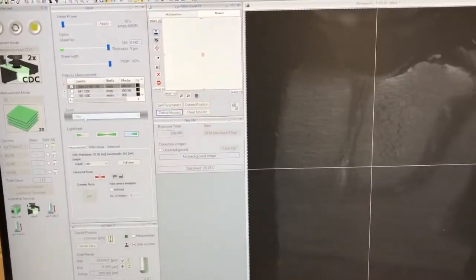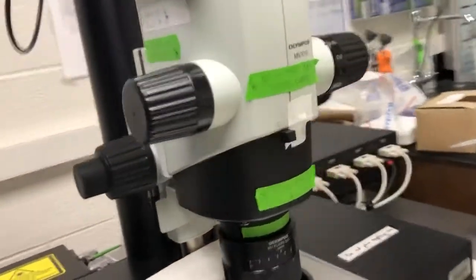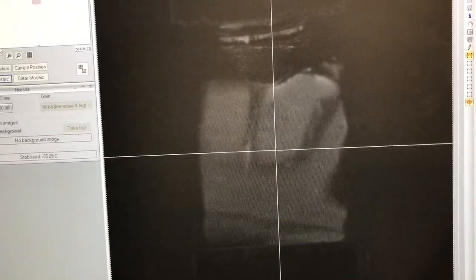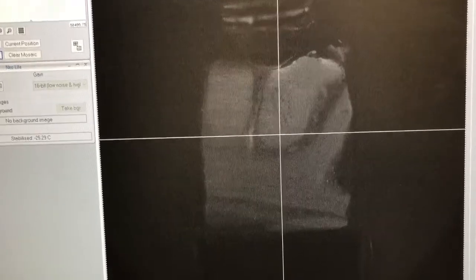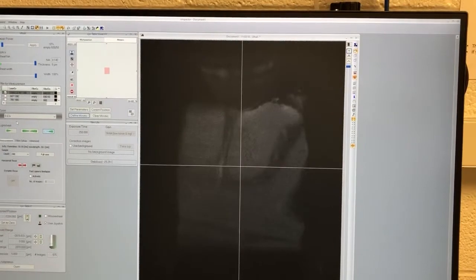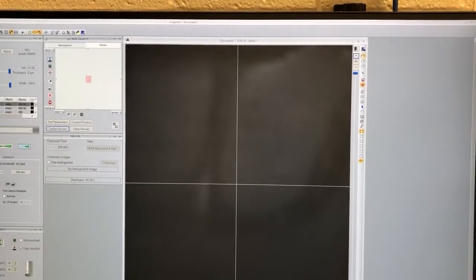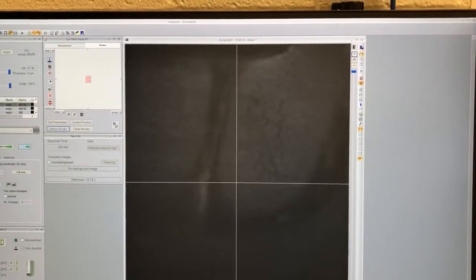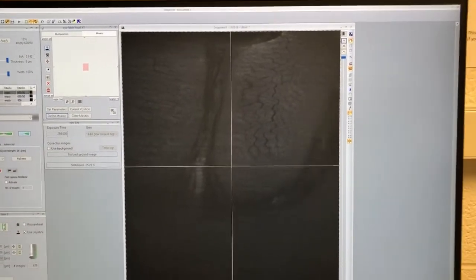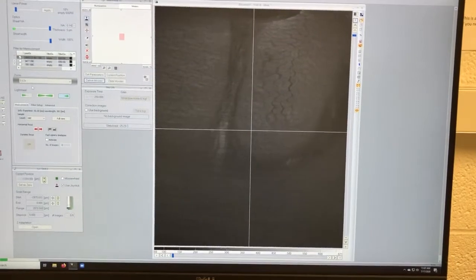There's a deeper issue: what should the zoom be? Going back to 0.63 — that's the very minimum. What should the zoom be? This depends mainly on how much detail you need in your sample and how big your sample is. If you want a lot of detail, you'll need to zoom in. Beyond a certain point, if you zoom in too much your sample may not fit in the field of view, which will force you to do tiling — a significant investment of time. If you decide to zoom in and want to cover the entire sample, note that you'll need to do tiling.